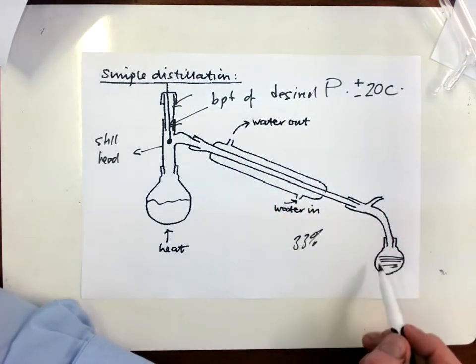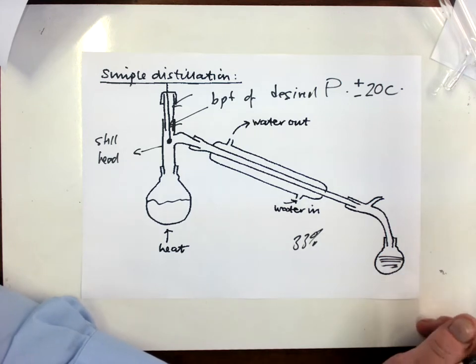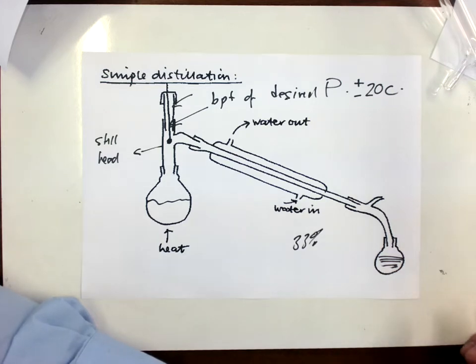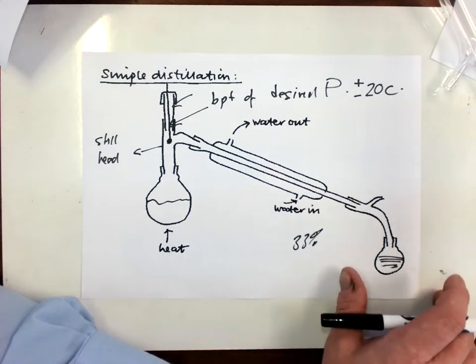Okay, and then at the end of that, you should have a fairly pure product, which if you were an organic chemist, you might be able to put on the market and sell to someone. So that's how we get a pure dry liquid, starting with certain reactants. In this case it was butan-1-ol, sodium bromide and 50% sulfuric acid, but that will depend on what the examiner asks you. But the method, the principle behind it, is exactly the same.